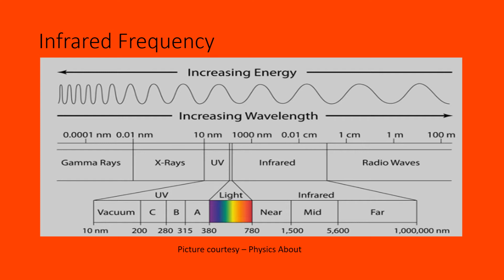But the frequency of interest for analytical purposes is between 650 cm⁻¹ and 3800 cm⁻¹. It is in the far infrared and mid infrared range.